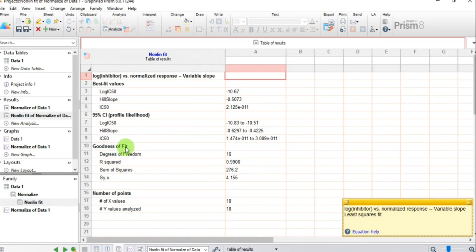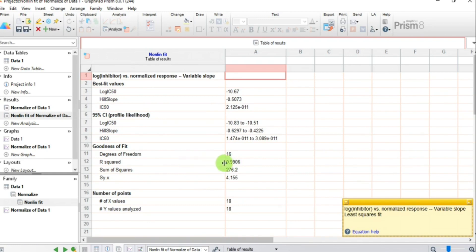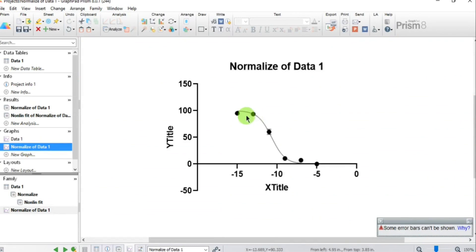Under Goodness of Fit, the R² value is 0.9906. This value should be close to 1, and it confirms that we have a good data fit. Now let's view the Normalize of Data sheet and you can see a beautiful sigmoid curve.